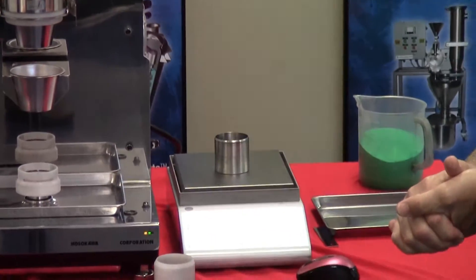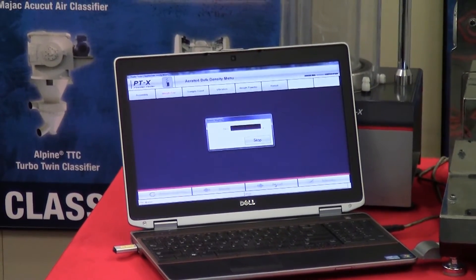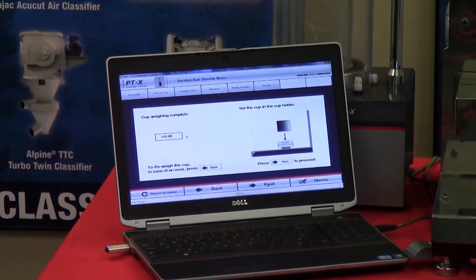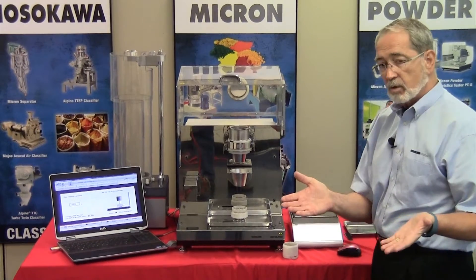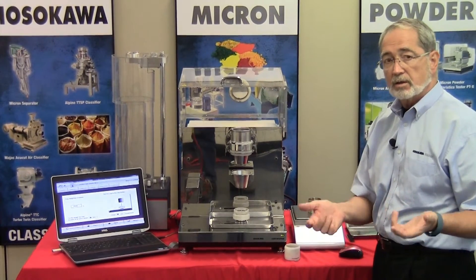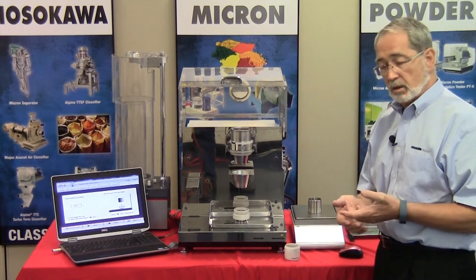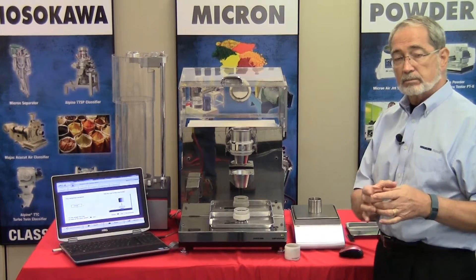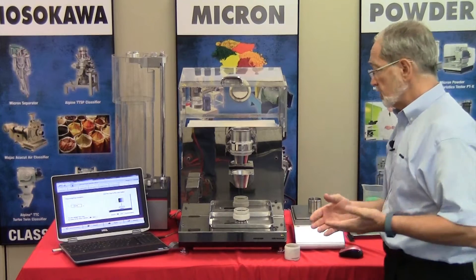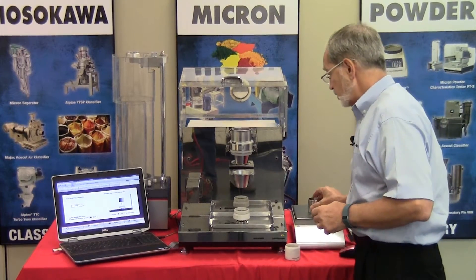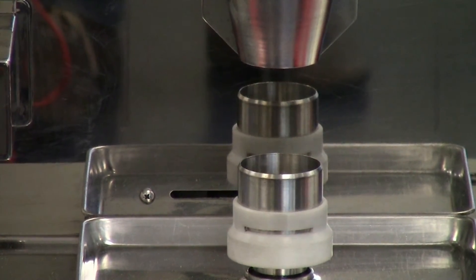We place the 100 cc cup in place and press next to take the tare weight of the cup. The cup is a defined volume — 100 cc. Unlike graduated cylinders, which rely on the individual's line of vision to determine settling, here we have a defined volume to identify the density. Now that we have the weight, we place the cup in its holder and press next.